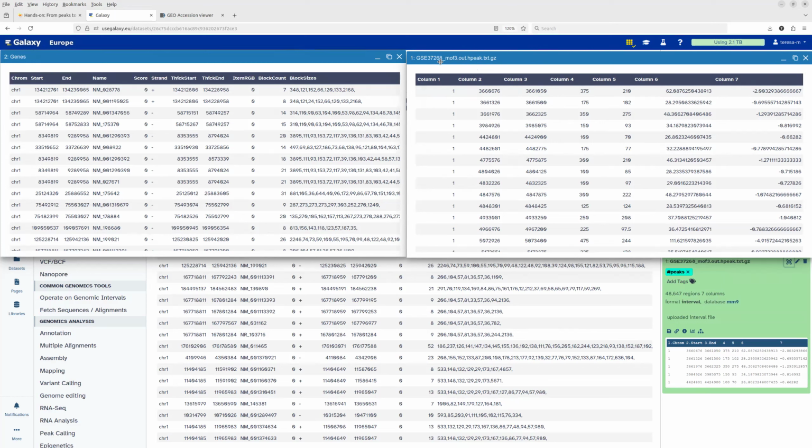So it might be nice to check this to make the files fully comparable, because what we want to do in the end is overlap those two files and see where we have overlaps to get for the regions in the interval files the names of the genes.